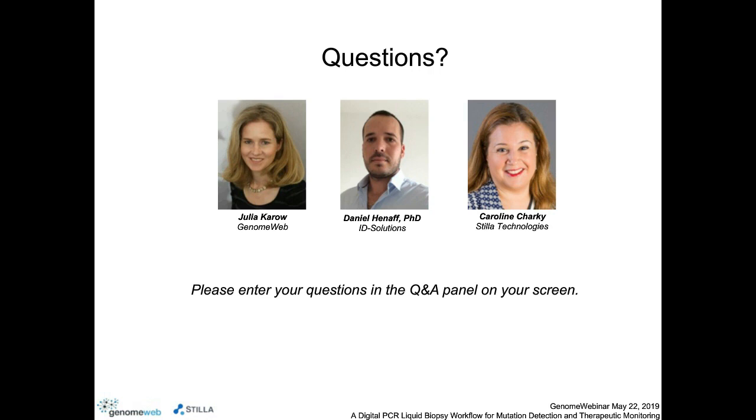Okay, thank you. Couple of technical questions for Daniel. Are you using, for the DNA extraction, kits that you have developed internally, or are you using a different vendor's extraction kit?